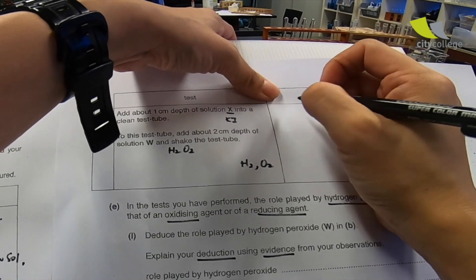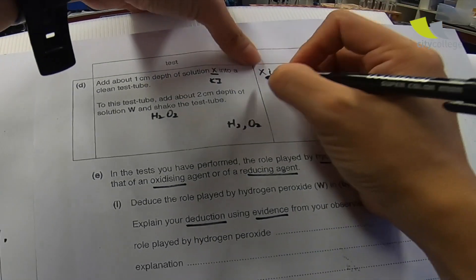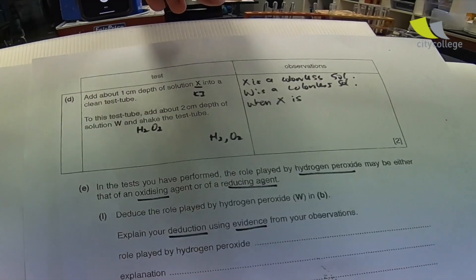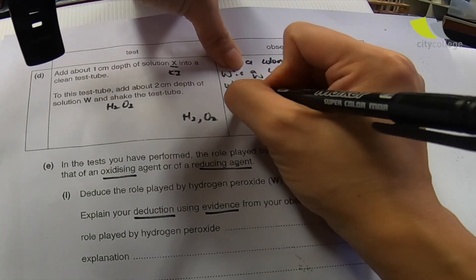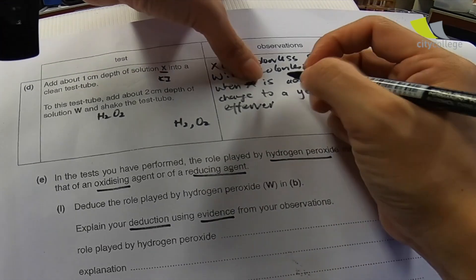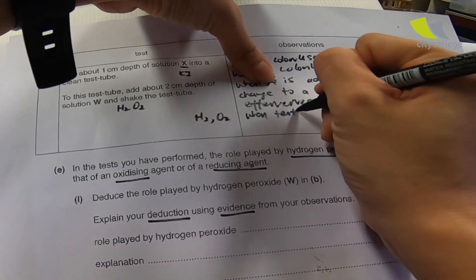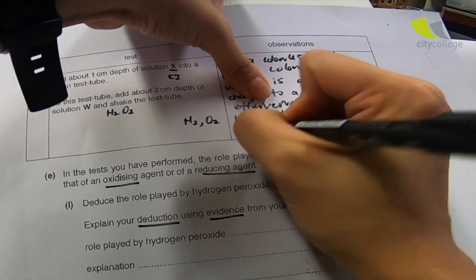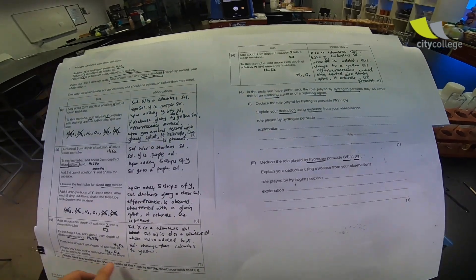X is a colorless solution. W is a colorless solution. When W is added, solution change to a yellow solution, effervescent E-F-F-E-R-V-E-S-C-E-N-C effervescent evolve when tested with glowing splint. It rekindle. O2 present. Now, let's go back to this part. Let's check what happened to the yellow solution.